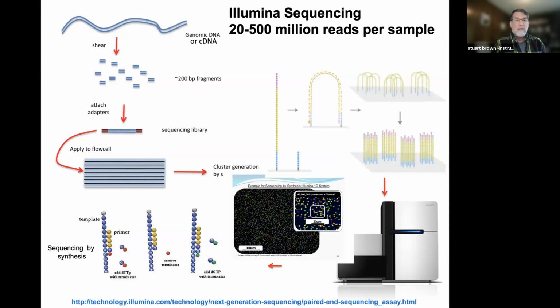Another innovation of the Illumina method is that the sequencing reaction is stopped after each base is added.